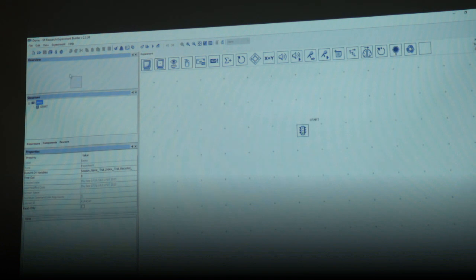So this particular window shows an overview. It just makes a diagrammatic map of what your experiment looks like. It's usually pretty useless. It's just for people who are very visual thinkers, who like to look at modules in a very visual format, how they are placed. It just helps you visualize.